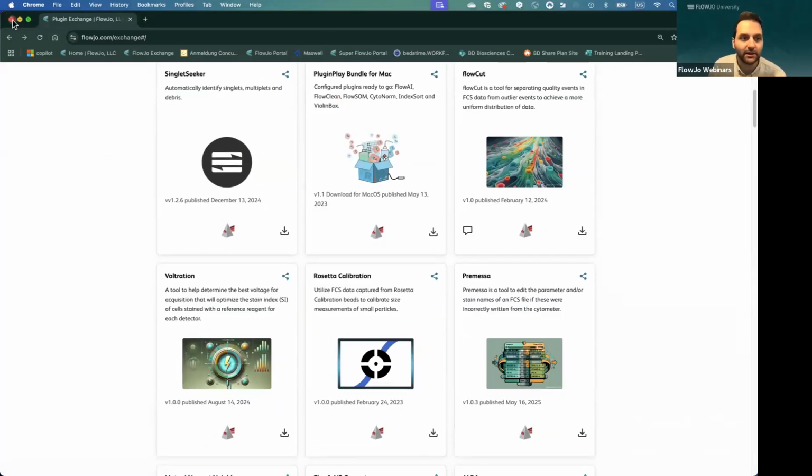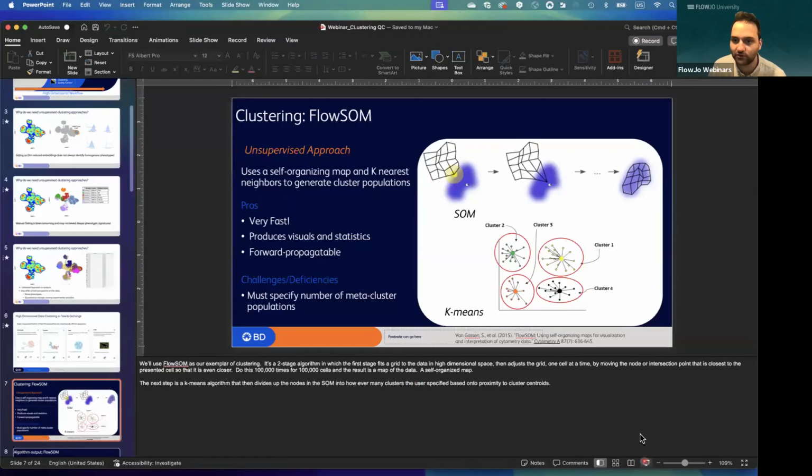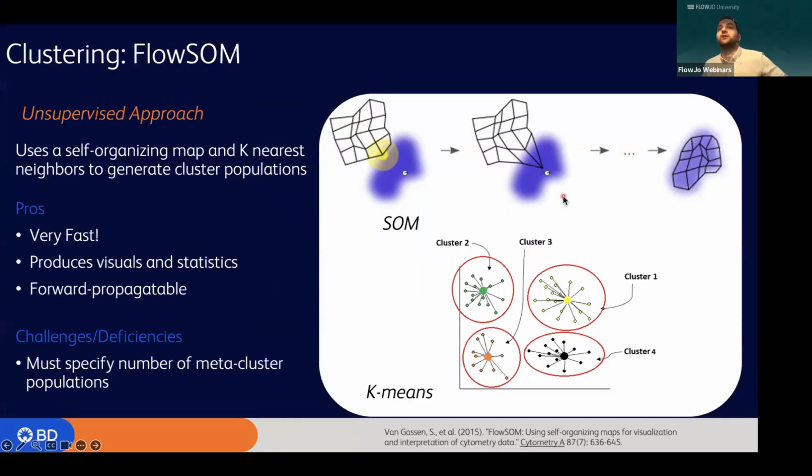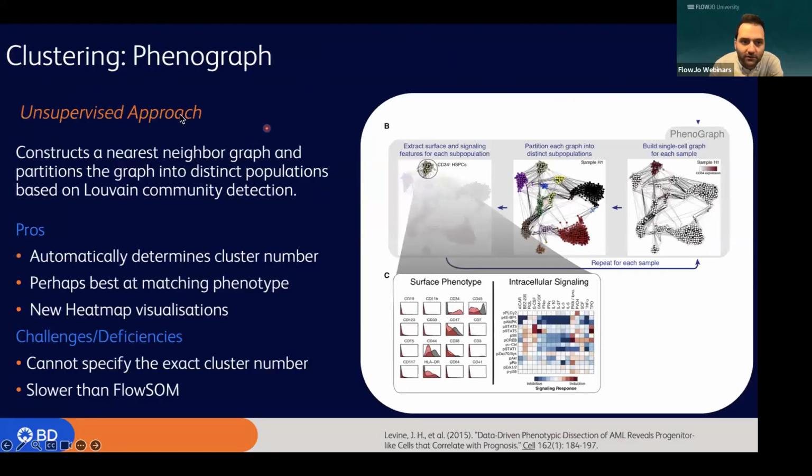Okay. Otherwise, you can find more information on our website on how to actually do those steps. It's not that difficult to connect the R environment with FlowSOM, and then it will run in the background.